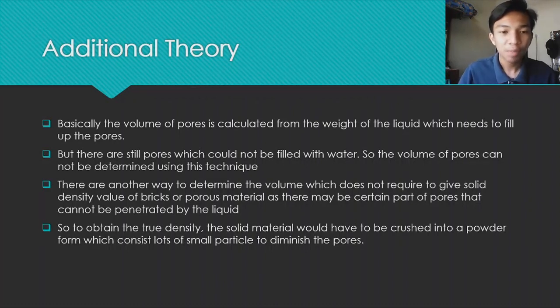There is another way to determine the volume which does not require any solid density value of bricks or porous material, as there may be certain parts of pores that cannot be penetrated by the liquid. So, to obtain the true density, the solid material would have to be crushed into a powder form, which consists of a lot of small particles to diminish the pores.